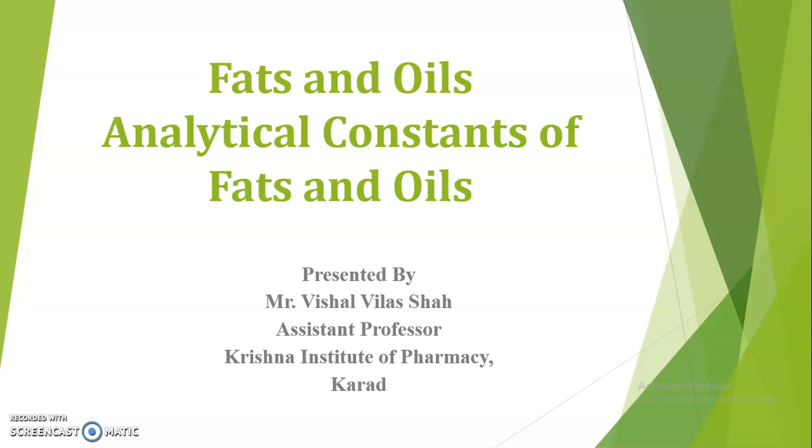Also, in this video, we are going to see in detail the principle involved in both the methods, that is the iodine monochloride method as well as the iodine monobromide method. So let's begin with today's session.